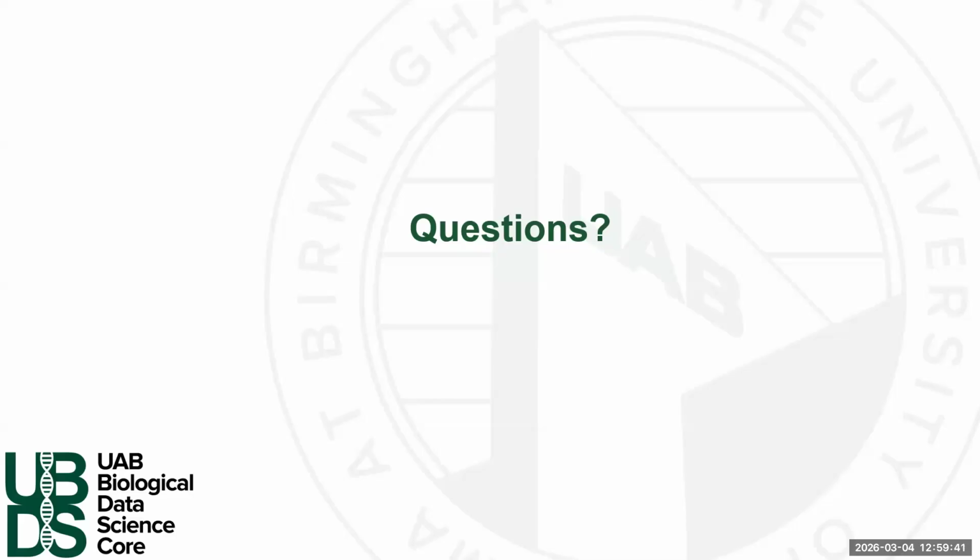But if somebody does have single cell data that's PacBio and they want to collaborate with us here, absolutely. If we have an active collaboration, I'll be looking at it right away. If there isn't an active collaboration, then it becomes a little more challenging on the logistical side. But again, I don't think the amount of work now is the same as it was a couple of years ago, because we've implemented peer review methods. Those methods are doing some of that work for us.